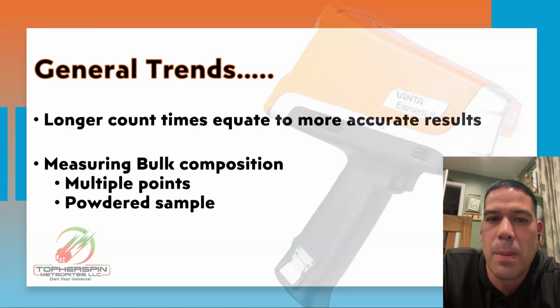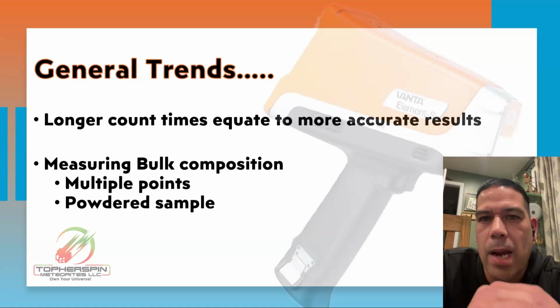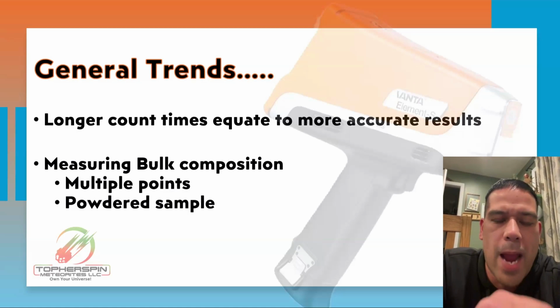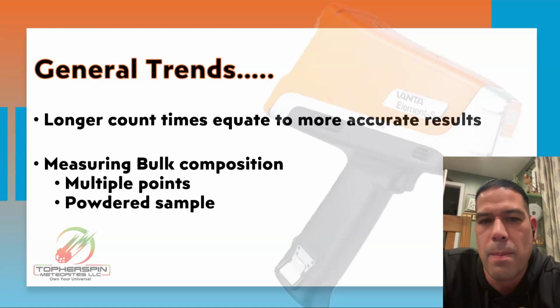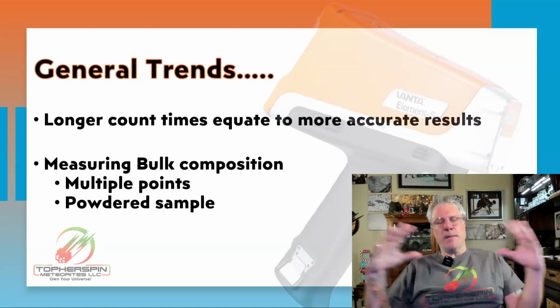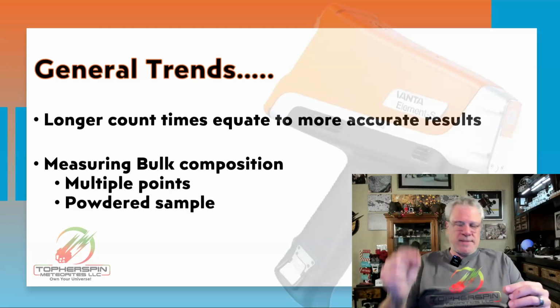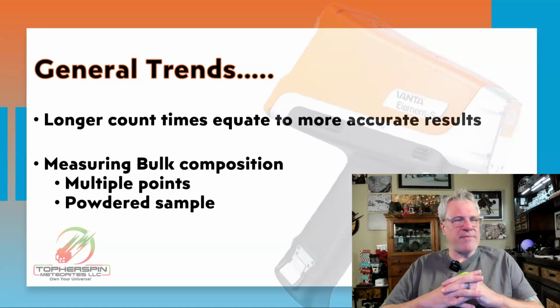But in labs, typically, if you're sending a sample to a lab that's focused on being highly accurate, they're going to say, give me 5 grams and I'm going to powder it. And then I'm going to either use the powder and acid wash it, or I'm going to powder it and then melt it into a uniform glass and read that. And then I'm getting true bulk composition. Perfect. Yeah, because it's all now been homogenized in the one thing, rather than going around taking more and more samples. You would have to cover a lot more samples to get that accurate of a result.